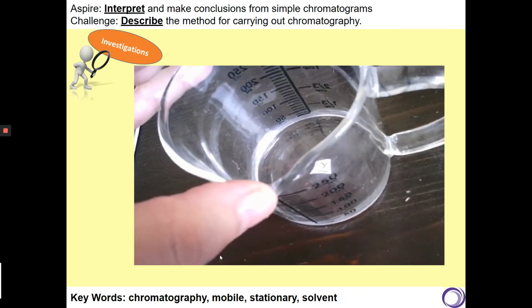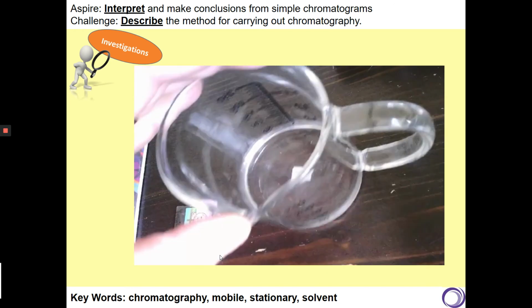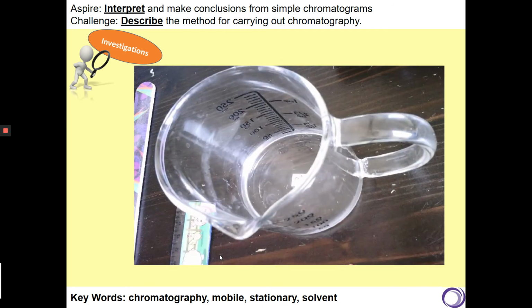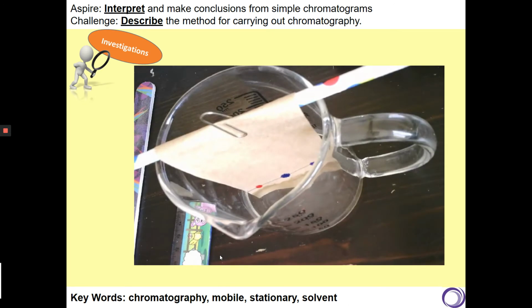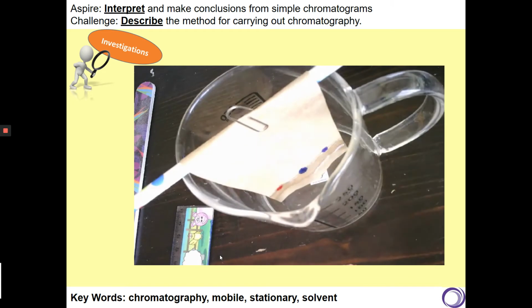And then to suspend the filter paper in the water, I just attached it to a straw with a paper clip, but you could have equally used a ruler or anything else that was straight. And just by doing that, it allows it to dangle along the top. You can see I put the paper in so that the water was below the dots, and then we allowed the solvent to rise up the filter paper and the colours start to separate out.